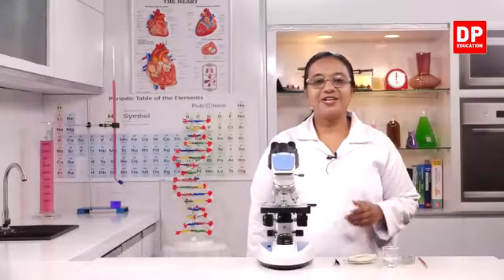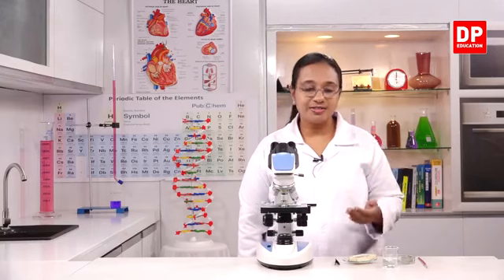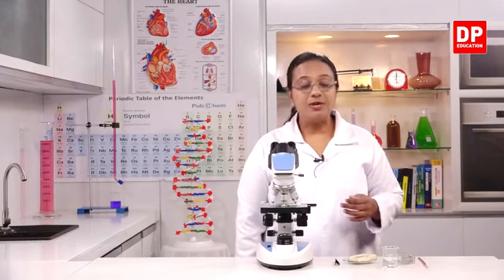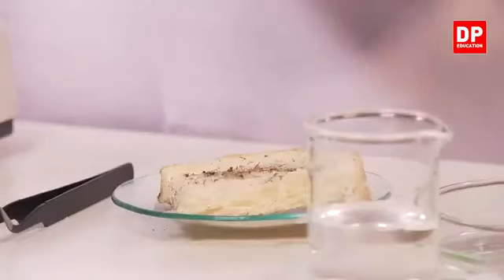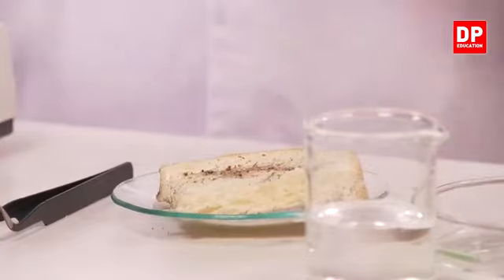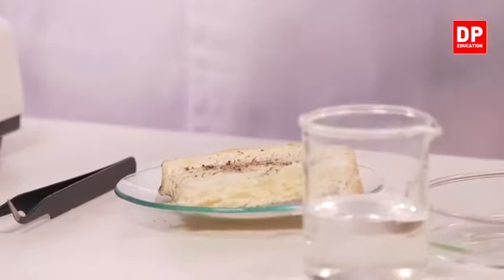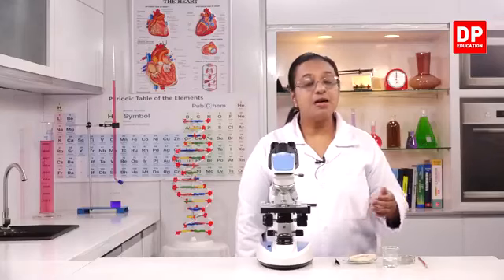Okay, students. So now we are going to observe a certain type of microorganism, that is mucor, a type of fungus that grows on bread. So I have already prepared a slice of bread. I sprayed water and left it aside for 3 days. Now here you can see the growth of the fungus, mucor.